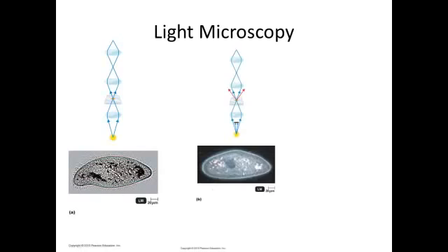Now, dark field microscopes, we mess around with how the light rays are bent, but we basically get a negative image of the organism. So you'll notice that the background is dark. That's why we call it a dark field microscope. And the thicker portions of the organism that are dark over here are actually lighter. Now you're wondering, why in the world would we want a negative image of an organism? Well, in doing this, the thicker areas pop out.